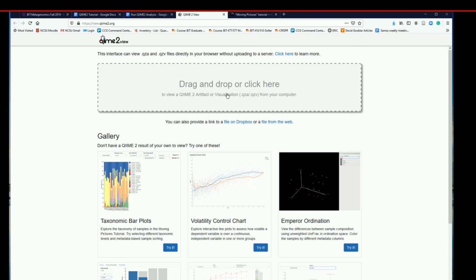Okay? Happy exploring QIIME. Give this a test, try it out, change the parameters, and look at your results. Good luck.